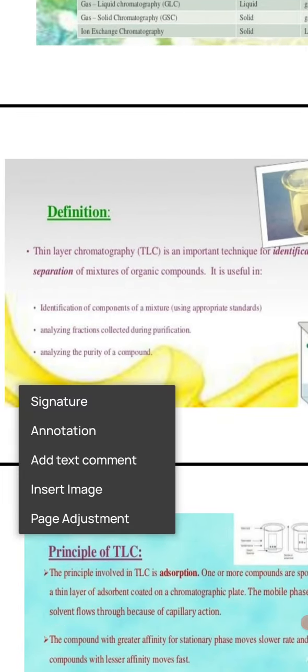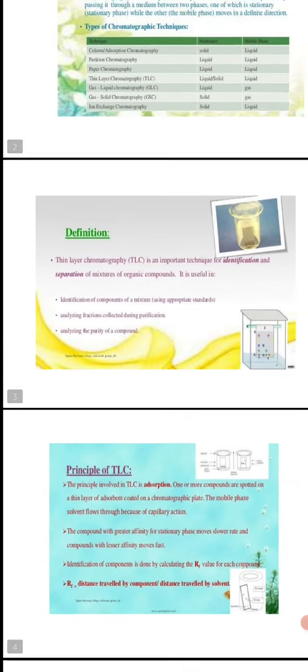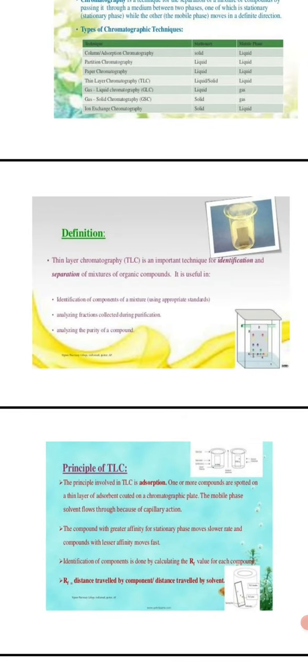After that we will move towards the definition of thin layer chromatography. It is also an important technique for the identification and separation of a mixture of organic compounds. अगर हमको किसी ऑर्गेनिक कंपाउंड्स के मिक्सचर को जिसमें ऑर्गेनिक कंपाउंड्स प्रेजेंट है उसको अगर सेपरेट करना हो या फिर आइडेंटिफाई करना हो तो हम TLC मेथड चूज़ करेंगे, दैट इज़ द थिन लेयर क्रोमेटोग्राफिक मेथड.